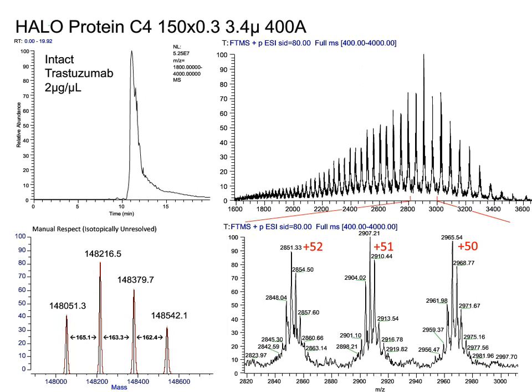In this case, on the right-hand top panel, we see typical high-resolution mass spectral data, in this case collected in difluoroacetic acid-containing mobile phase. We've blown up the mass spectral data under that panel so that we can see the charge state. We've then deconvoluted it using Protein Deconvolution version 4 from Thermo, and we're able to resolve the N-linked glycan variants on the antibody.